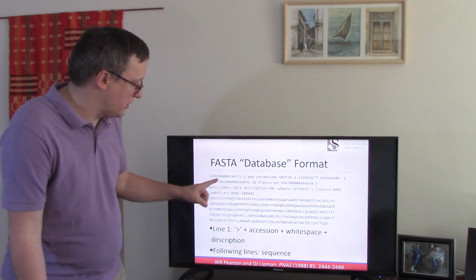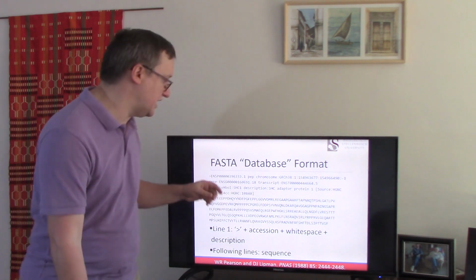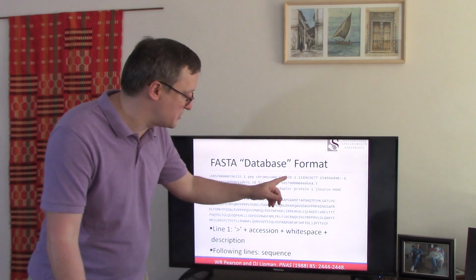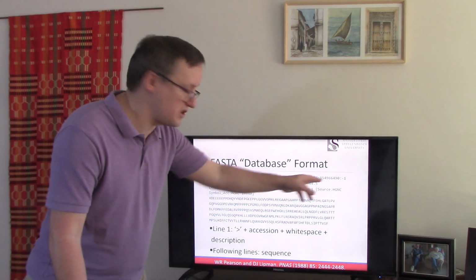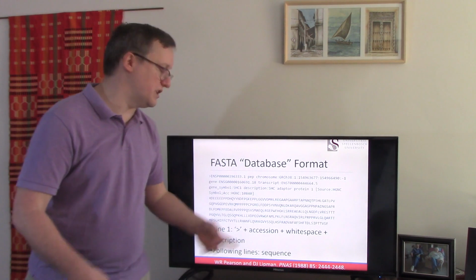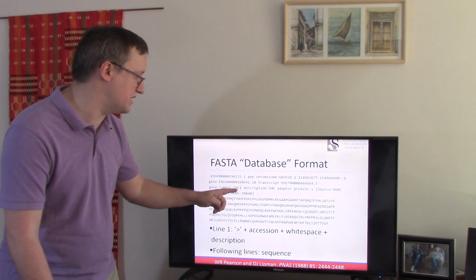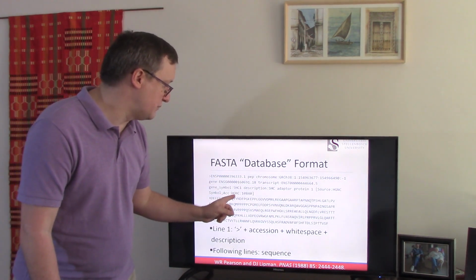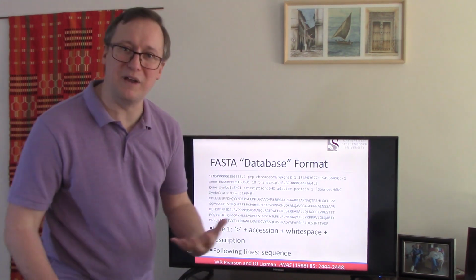So what we see is that we have annotation and we have sequence letters. The annotation here is giving us an accession number to say this particular protein in the Ensembl database is a sequence type protein. It comes from this chromosome in this particular annotation of the human genome. It has these positions within the genome annotation, has this gene symbol and this transcript symbol associated with it. And finally, we get down to the description of what this particular protein does. An SHC adapter protein number 1, it's got the gene symbol, it's got piles of information made available about it.